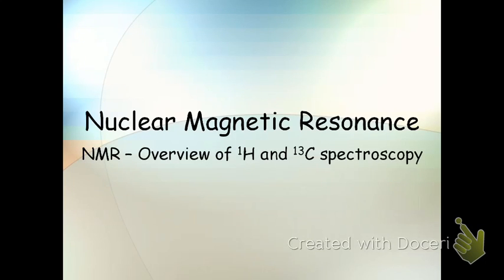This is a lecture to introduce you to nuclear magnetic resonance spectroscopy, or NMR as we usually call it for short. And there are a number of atoms that can be studied using NMR. In particular, two that are very important to us at this point are hydrogen 1 and carbon 13. And I'll talk to you a little bit about why that is as we go through this short lecture.